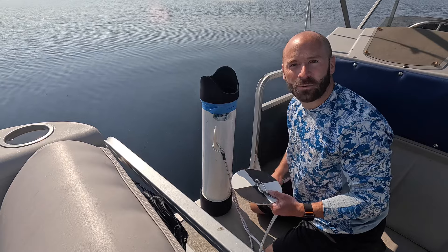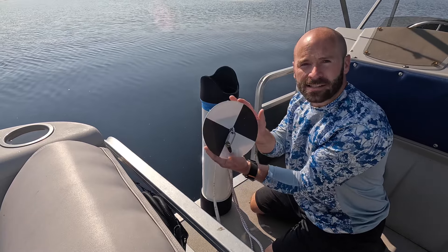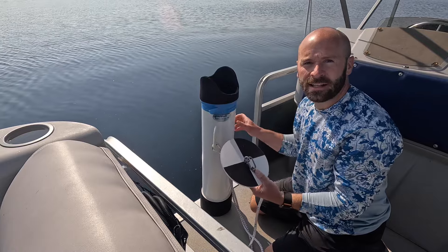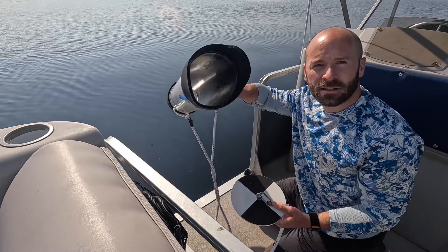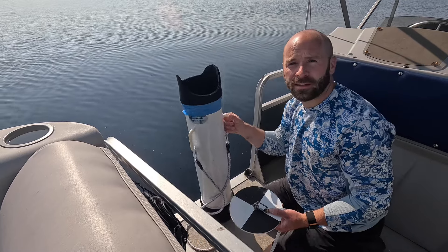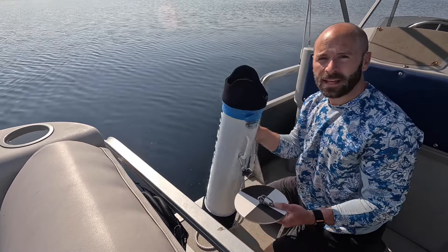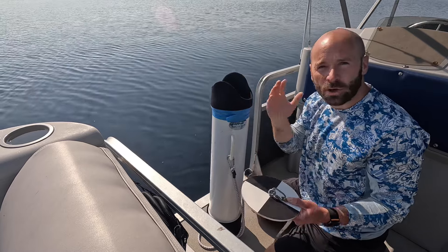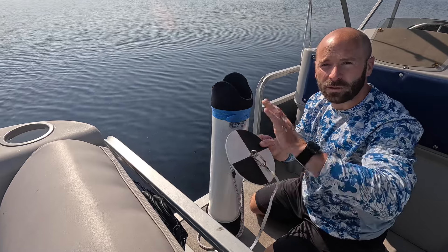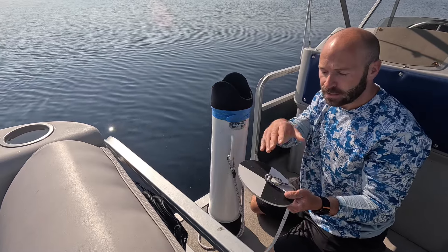The first test we have is the water clarity, and we use this, which is called a Secchi disc — two black triangles, two white triangles — and this six-inch aquascope. You put that end in the water and cover your face up so no light gets in, and you see how far you can drop this disc before you lose sight of it completely, including the glow.